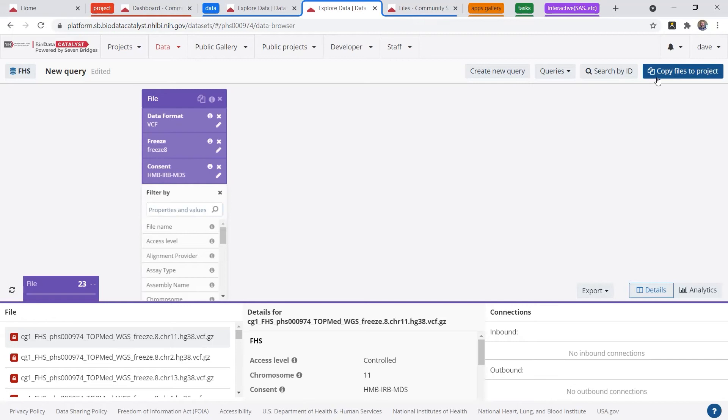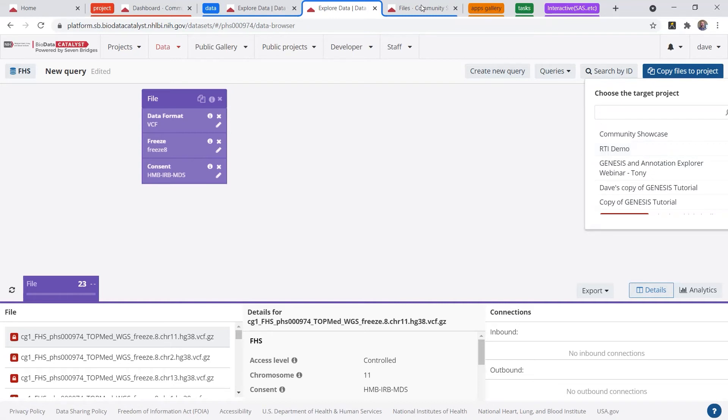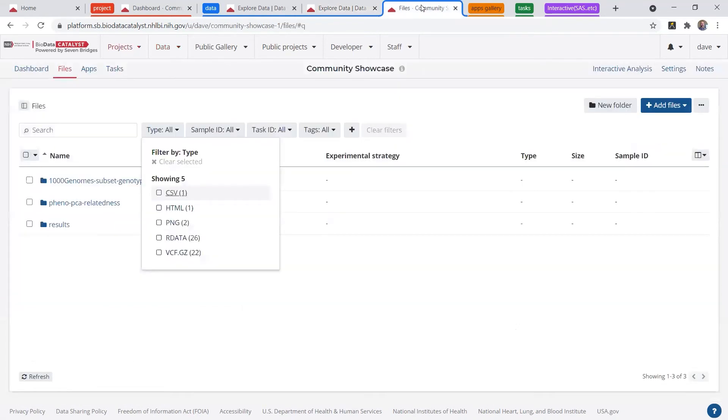At this point, I could link the pointers to my project. This is where the platform is going to programmatically check your dbGaP credentials to make sure you have the appropriate access level for this particular study. Today, I'm just going to show you some 1000 Genomes open data.